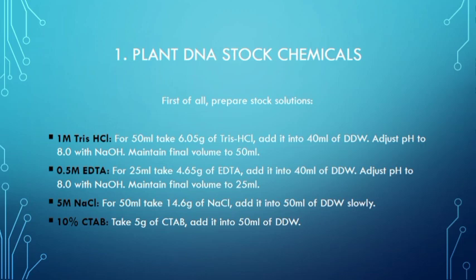You need precautions, because when you add NaCl into the double distilled water, the solution will heat up. So I suggest using plastic vials, not glass.